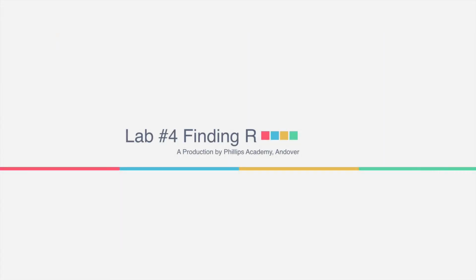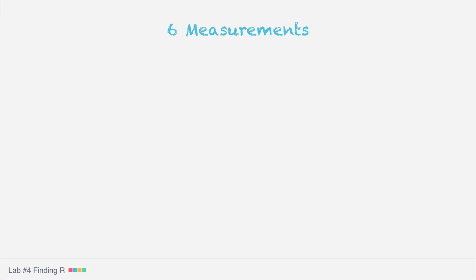Thanks, Carter. Let's review a couple of the key details for this lab. The first thing to note is that there are 6 measurements that we need to record before we disassemble our setup, so make sure you have that number in the back of your mind. Remember, our overall goal in this lab is to calculate the ideal gas constant.